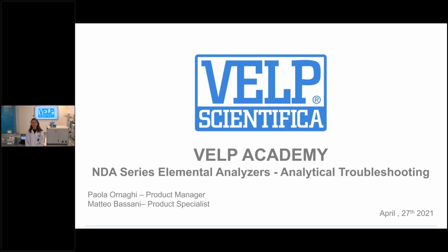Good morning to everybody and welcome to this first online analytical training. Today we will focus on the analytical troubleshooting of Velp NDA series elemental analyzers.